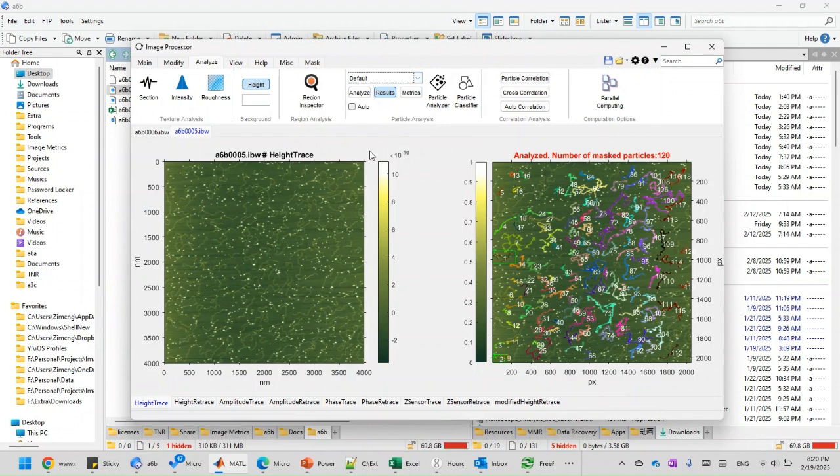And before you close every program, just to remind you, it's best to save that again, because it won't autosave for you. Just before you close everything, remember to save your workspace again. Now, if you really forget about that, the program has auto recovery features, so you can load your last analysis back into the workspace as well.